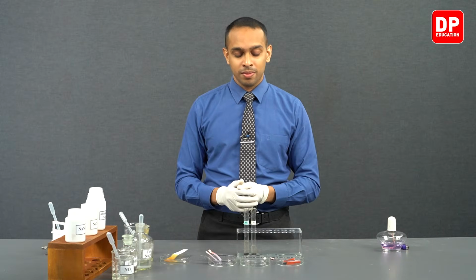The same observation can be made with the Devarda alloy as well. This alloy is made out of aluminium, zinc, and copper. This alloy will also give you the same results if you experiment with the alloy using nitrate or nitrite ions.